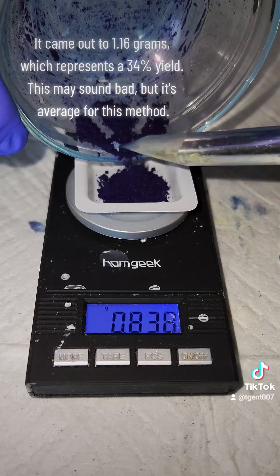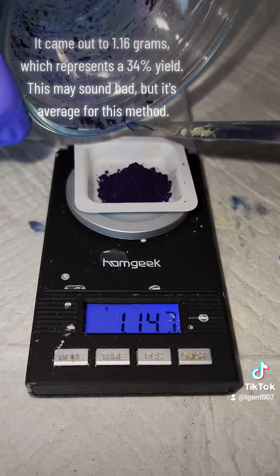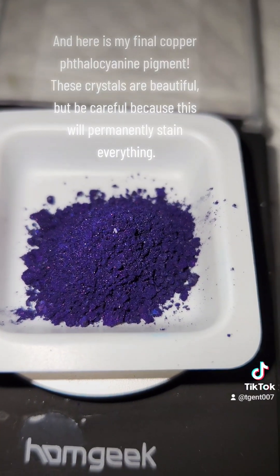It came out to 1.16 grams, which represents a 34% yield. This may sound bad, but it's average for this method. And here is my final copper phthalocyanine pigment.